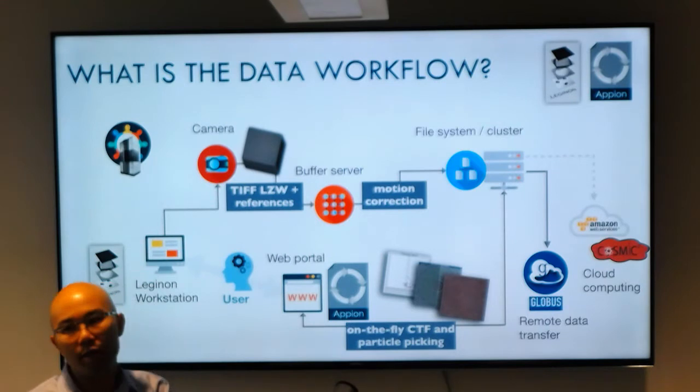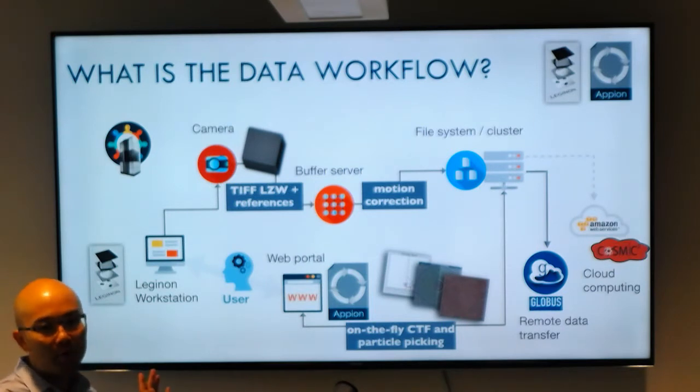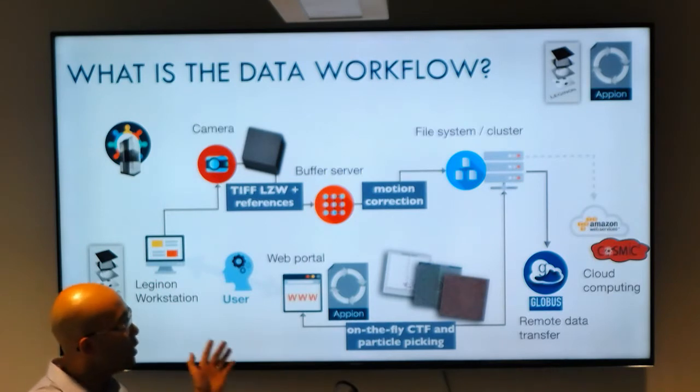Okay, so this is the stage we're going to assume you're at, and we're going to springboard forward. Before I get too far ahead of myself, does anyone have any questions about what I consider Appion Part 1? Is everyone able to do that or have the tools to do that? If not, we can cover that. Okay, I hear silence. So now let's go forward.